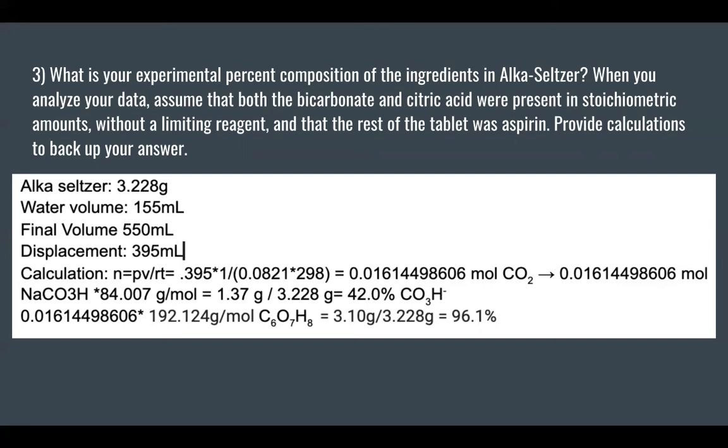I found the mass to be 1.37 grams, and dividing that by 3.228 grams, I found that the percent composition of the bicarbonate was 42%.